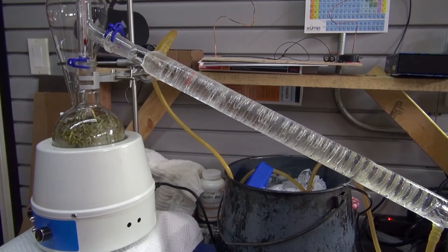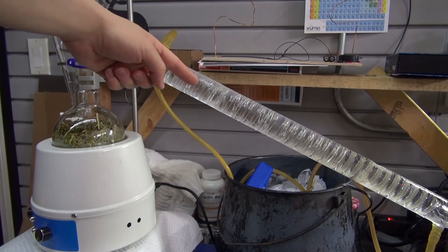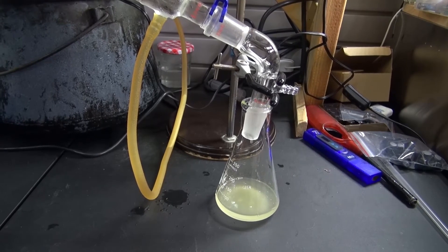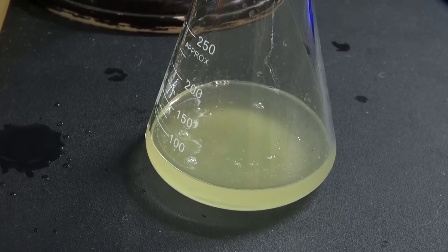20 minutes later, and as you can see the water is boiling and the steam is being condensed inside of the Graham condenser. Rosemary essential oil and hydrosol is being collected inside this Erlenmeyer flask. But this color is a little bit concerning, I believe it's contaminated.